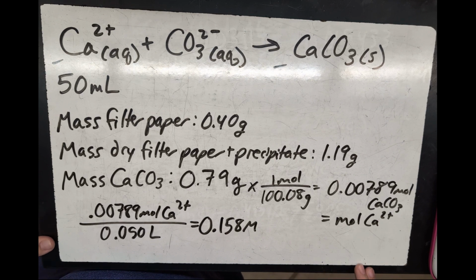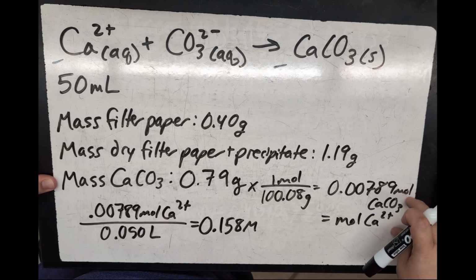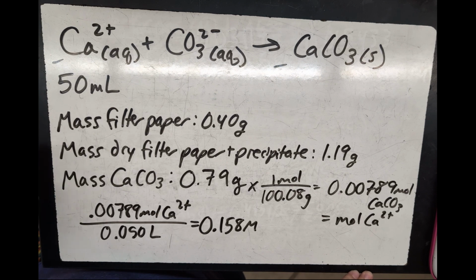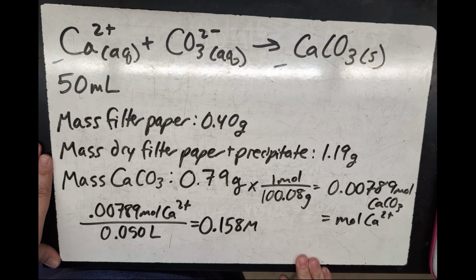Now you could put this in different units if you choose. Sometimes they'll do like grams per liter or grams per 100 milliliters, and then you can compare it to some given cutoff where a person would need to use a water softener. You could also have students rank. This is what I do. I'll have the students rank them in order from the least concentrated calcium ions to the most concentrated calcium ions, so they can see which one is most likely to need a water softener versus least, and have them put them in order.